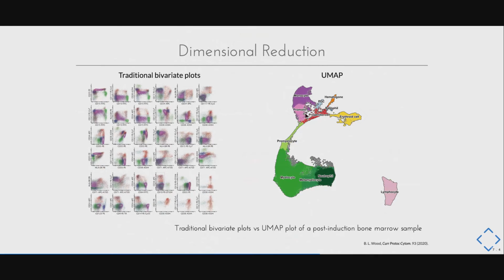For dimensionality reduction, we choose UMAP for two reasons. First, it's very effective in visualizing continuous data and the nonlinear structures, which often present in changes of phenotypes during immature cell development. And the second is it's very fast, especially compared to t-SNE.